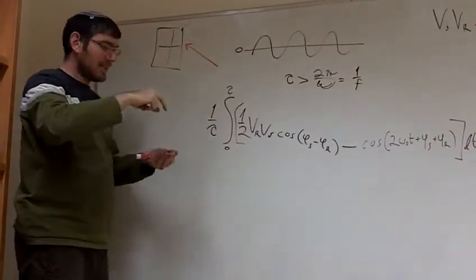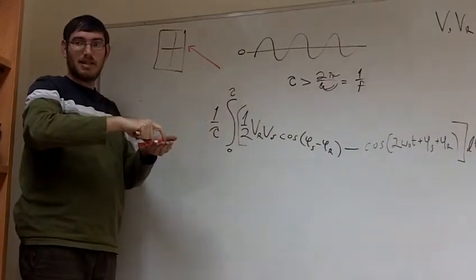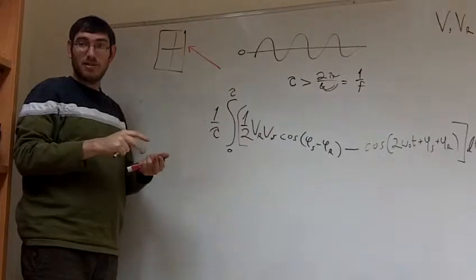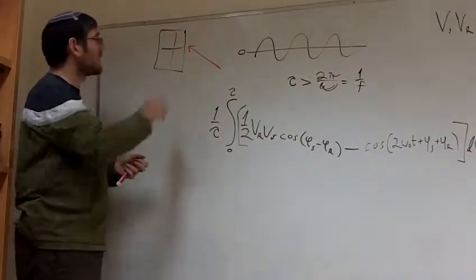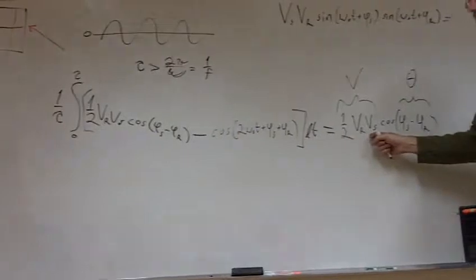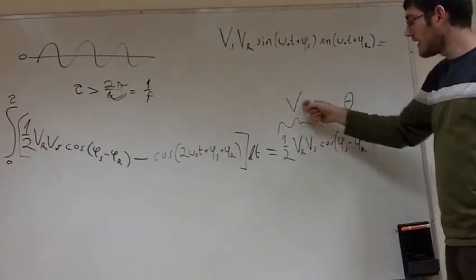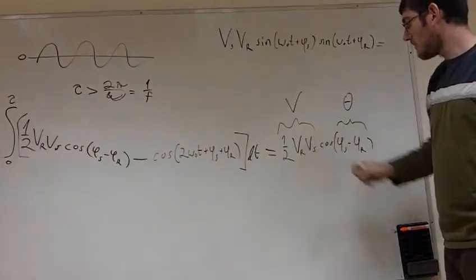When the tip gets close to the sample, there's a force between the tip and the sample. In general, that force will make the oscillation amplitude smaller. So we're going to see a smaller amplitude, our V signal will be smaller, and therefore this whole term is going to be smaller.